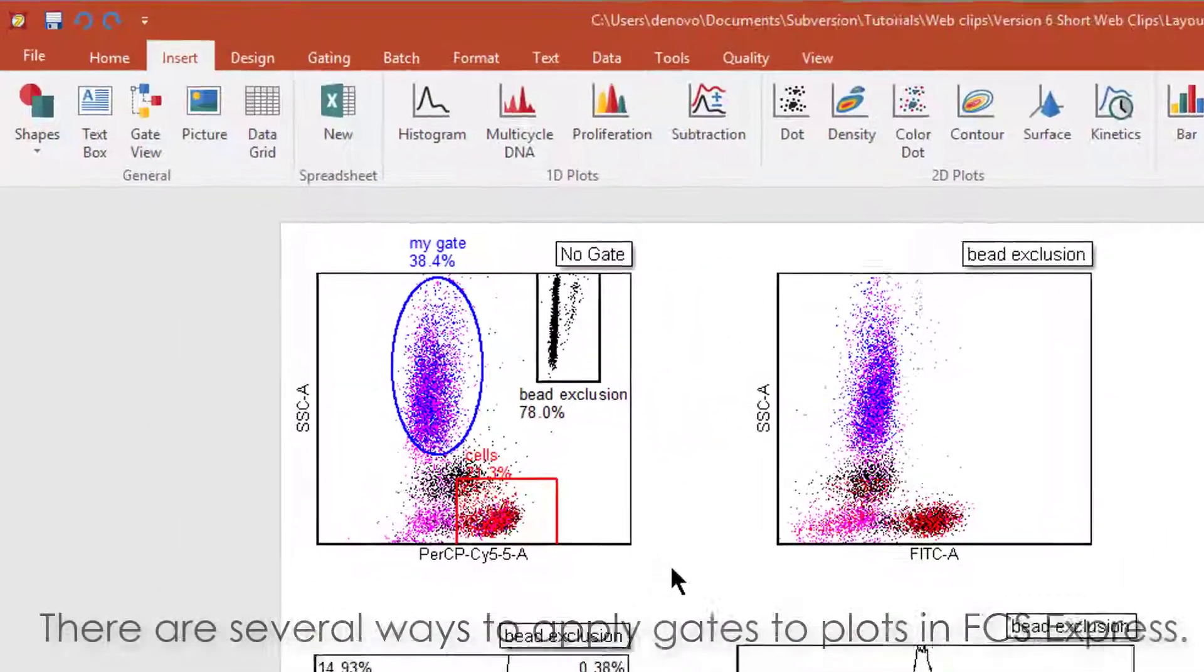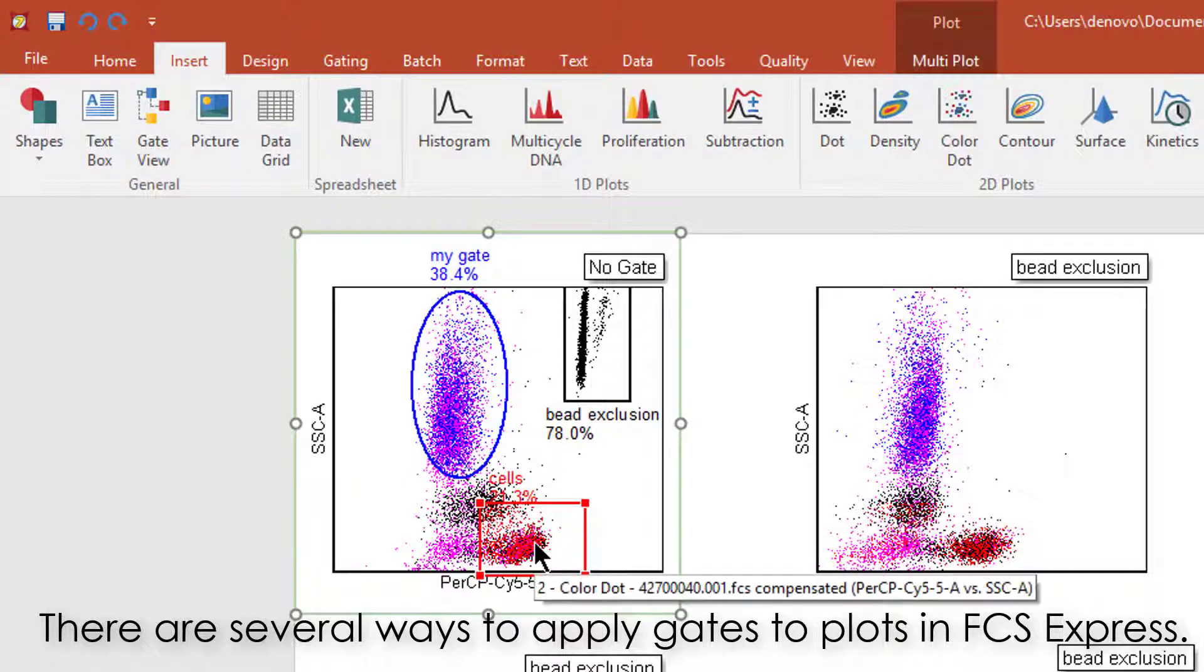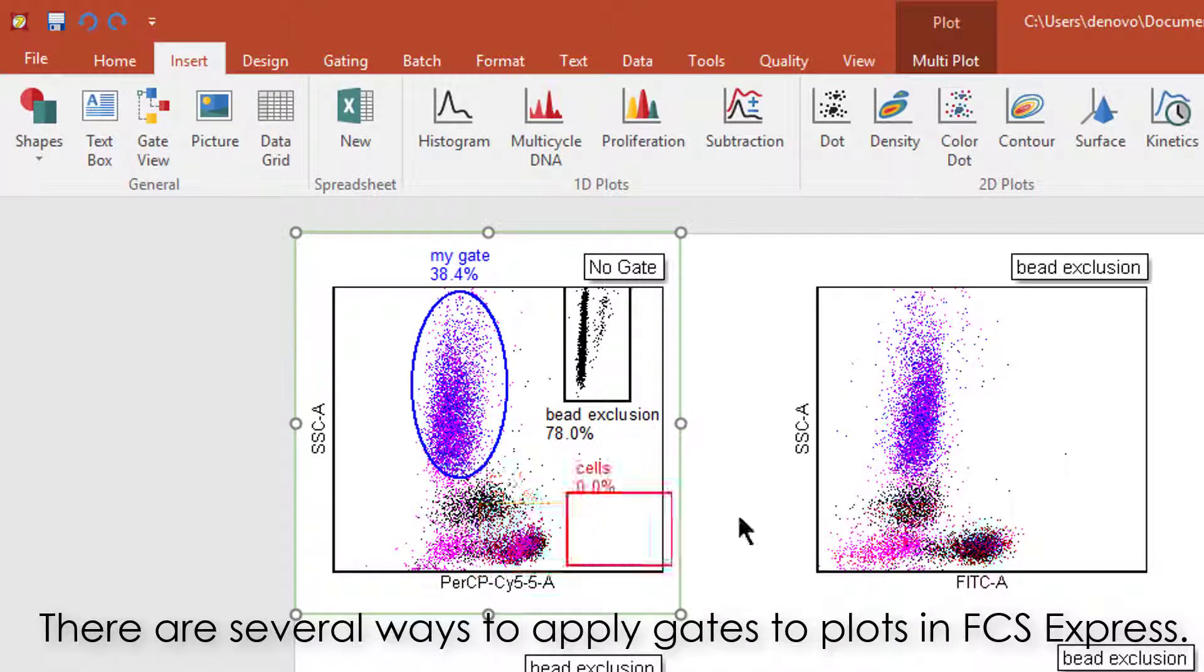There are several ways to apply gates to plots in FCS Express. One is to drag and drop a gate from a plot to another.